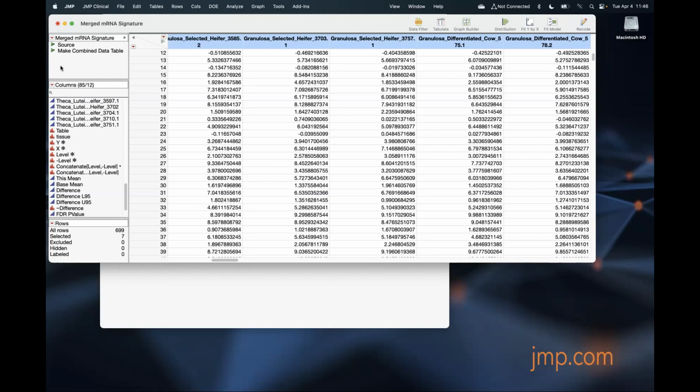Great, thanks. And I think that's all for right now. So why don't we move on to the next example? Oh, you got it. I did have a quick question here too. Can you get a copy of this journal and data sets used? Absolutely. When I'm done here, I'm just going to take the original data set and the individual journals for both of these use cases, and I can provide them for you. We also have a nice website, which I'll point to just at the end here, that has some more examples to follow along with as well, that also has links to data sets. So I'll make sure I point that out.